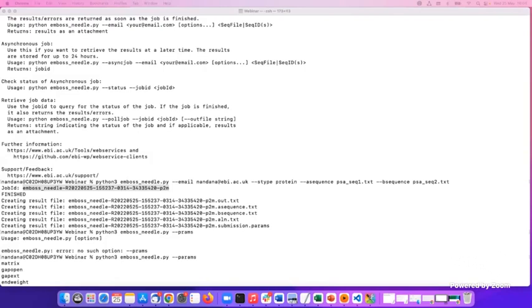Thank you, Nandana. So the other one asks if you can please demonstrate genome alignment. Oh, okay. I think we have only one sequence tool for genome alignment, which is GeneWise. Do you want me to show that now? Yeah, we could maybe move to the next questions, and at the end you could show that, if that's okay. So we come back to that soon.